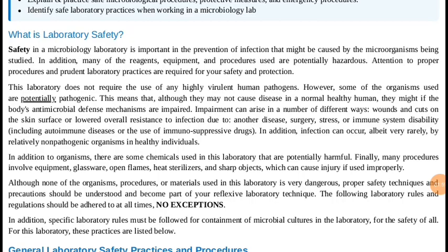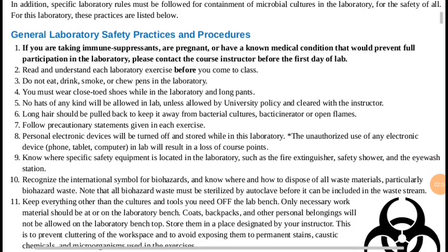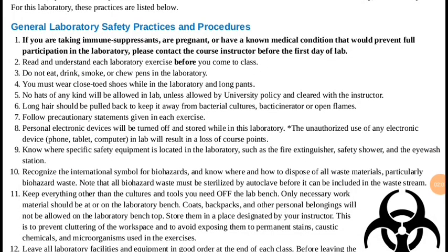Therefore, we also have general laboratory safety practices, and we have a lot here, but we'll just talk about a few of them. There are those basic ones that we know, that we're not supposed to eat, drink, smoke, or chew pens in the laboratory.